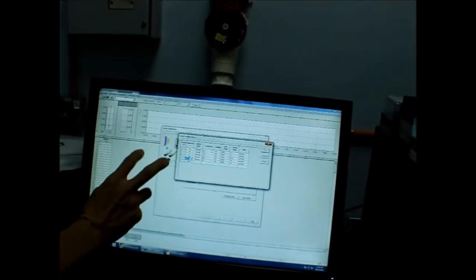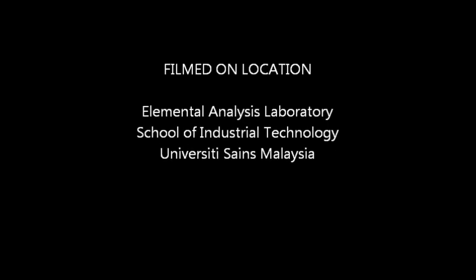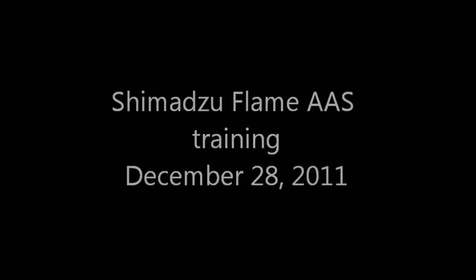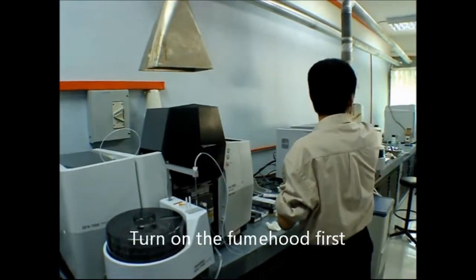If not, you cannot select. This one no need, I'm not using it.